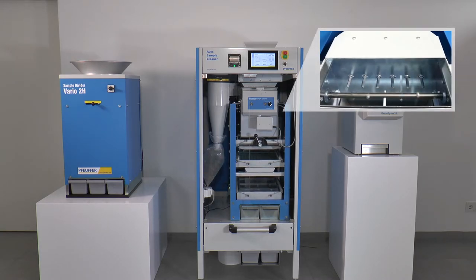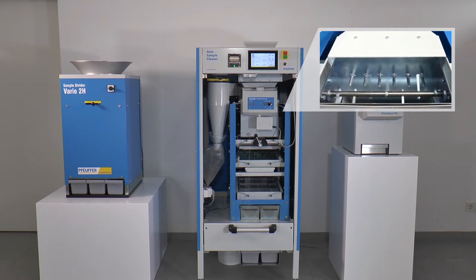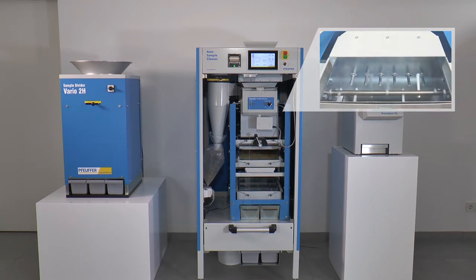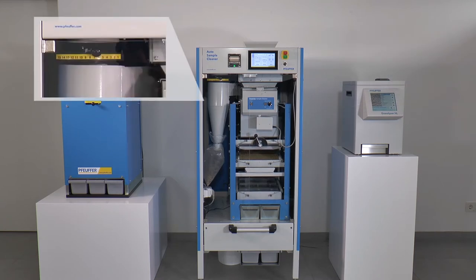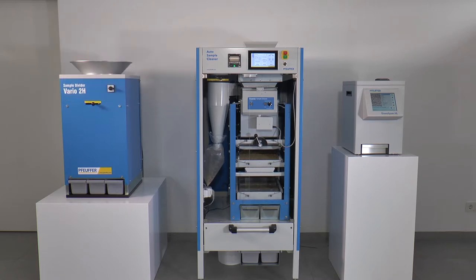With rotating metal pins, the deorner can remove awns from grains like barley. The calibrated cyclone aspirates dust and light material from the constantly passing sample.